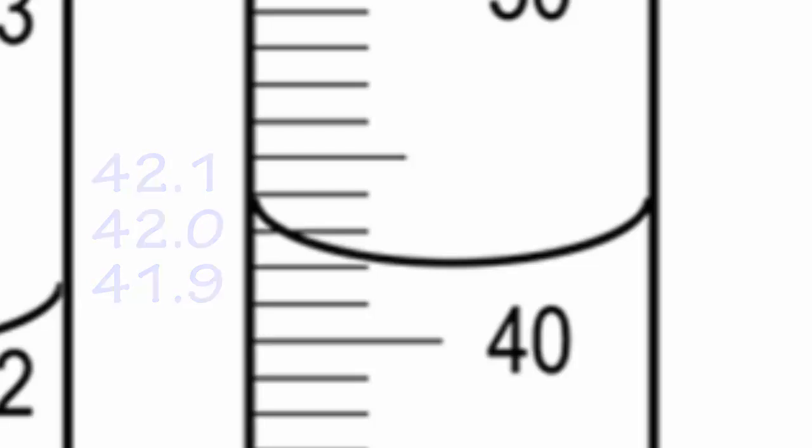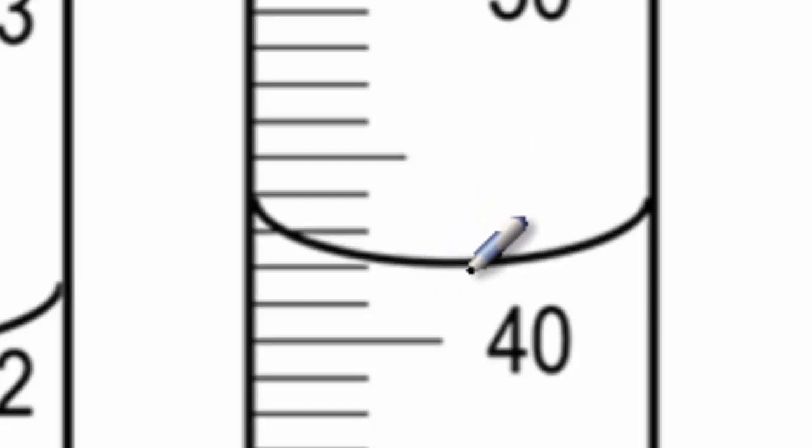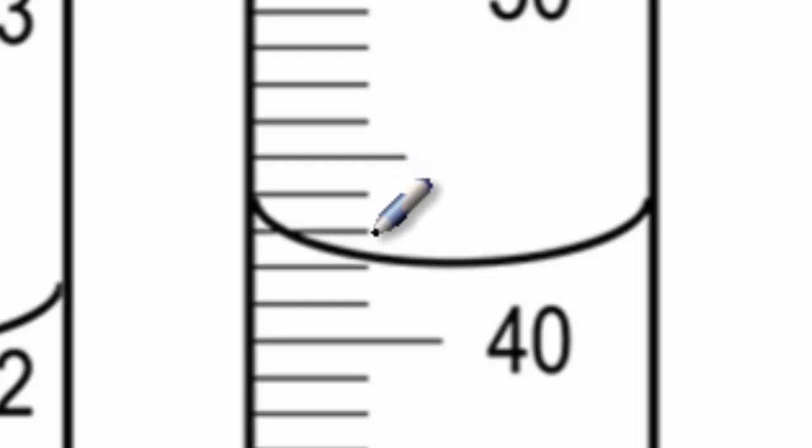Now, if you said 43 point one, you'd be precise the way you should be. But you wouldn't be accurate because this isn't up to 43. And again, we always want to read the bottom of this curve right at the lowest point. You can't read 43 be way up here. It's nowhere near that high. So if you're to say 43 point one, your precision is good, but your accuracy is actually way off. If you're to say 41 point one, again, your accuracy is off. If you're to say 42 point one five, you're accurate, but you're being actually more precise than you're allowed to be.